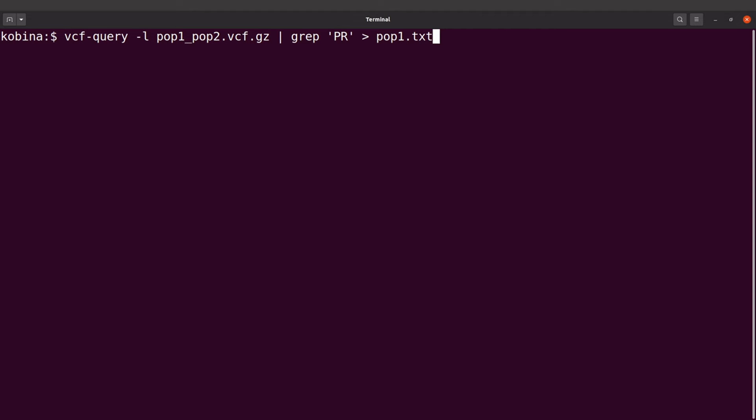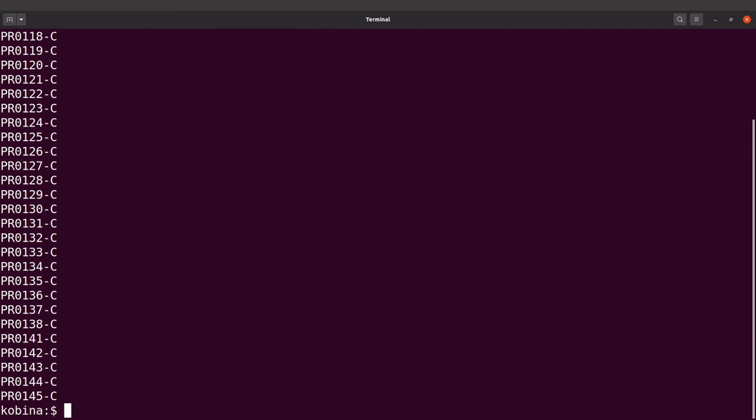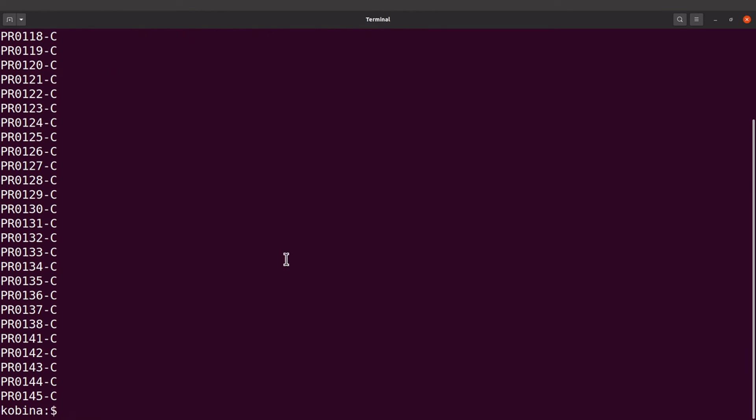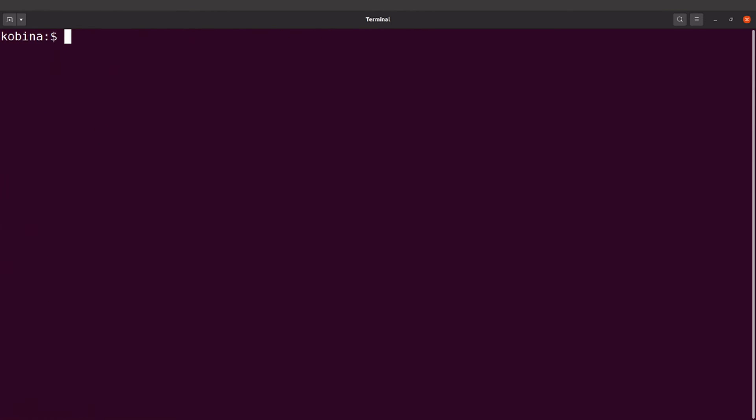Okay so that's population one. So if I do an ls I'll see pop one. I'll use the cat command to display it. Okay that's for pop one.